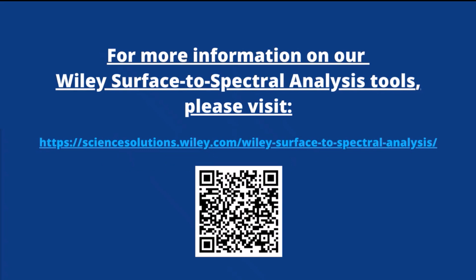So you'd use KnowItAll in conjunction with surface-to-spectral analysis if you want to be able to search for specific spectra against a library database of spectra. Thank you.